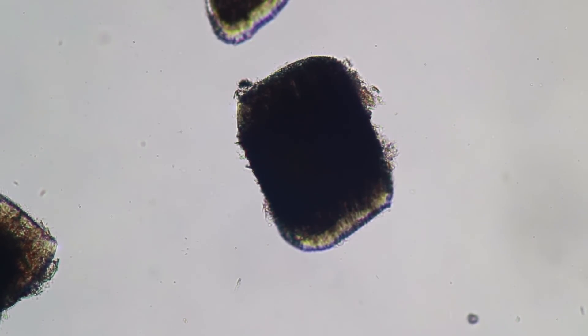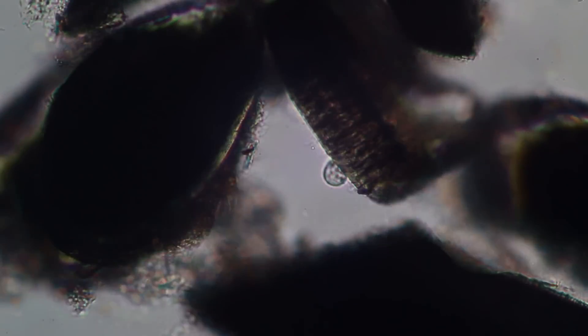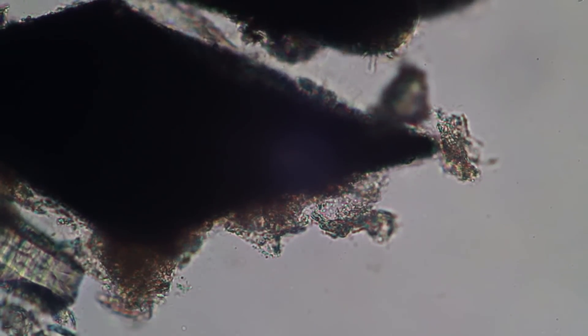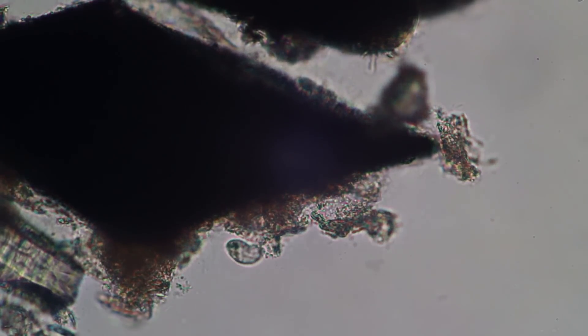I saw some stuff floating around here. Look carefully, there are little animals here - these are ciliates. What in the world are they doing there? I checked in a different place and found many of them actually. I was wondering where in the world do they come from. I cannot imagine they were growing in my face on my chin.